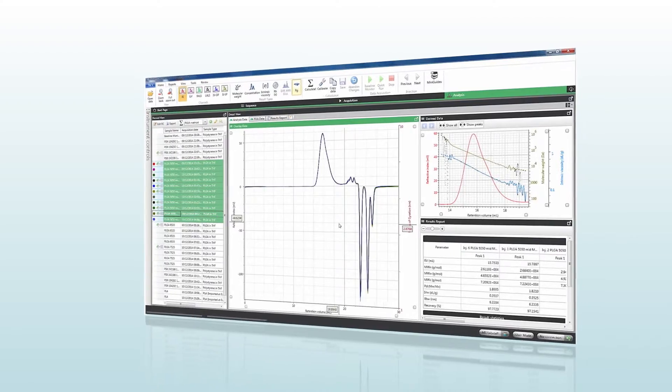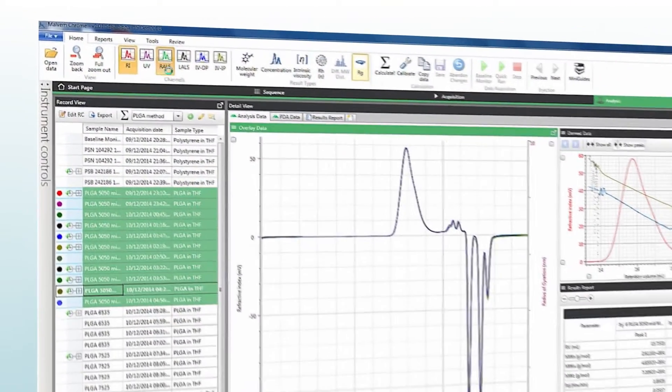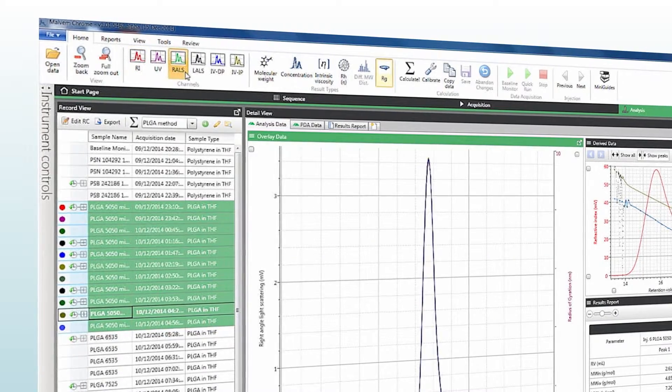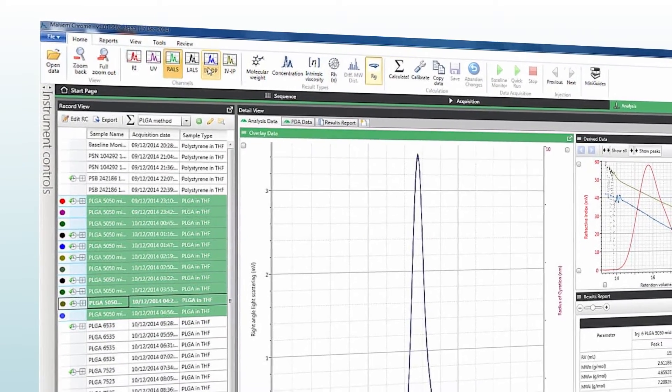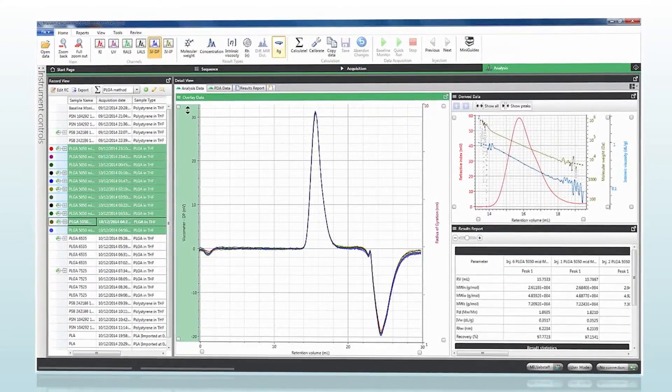But the most important part of the system is the interface between the user and the instrument, and Omnisec software makes life easier at every step. It is a completely new version of our advanced SEC software which controls the entire system from data acquisition through to analysis and reporting, using a simple workflow-based design.